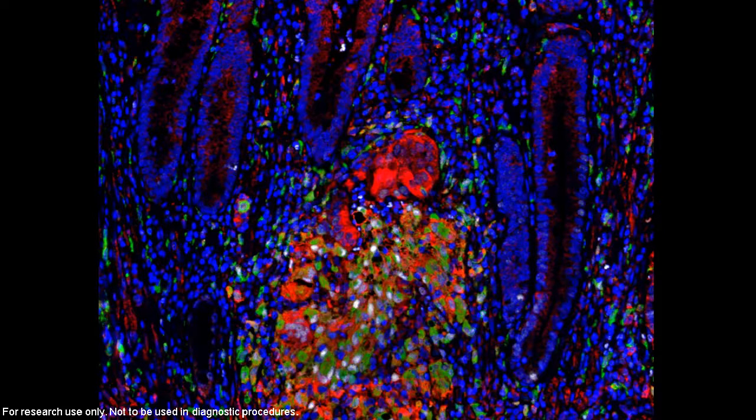So here they could take, say, some bone marrow-derived macrophage or some monocyte-derived macrophage, activate them with interferon gamma, perhaps incubate them in the presence of bacterial contents, simulating this loss of barrier integrity, and then challenge them and use inhibitors of our target of interest to understand the biology of disease in a context that's most appropriate to our disease and some of the features of that disease.